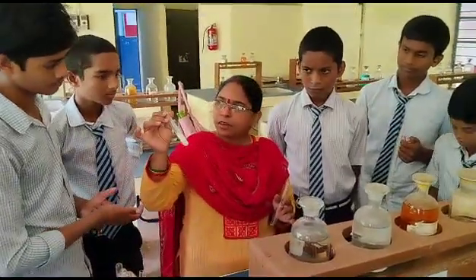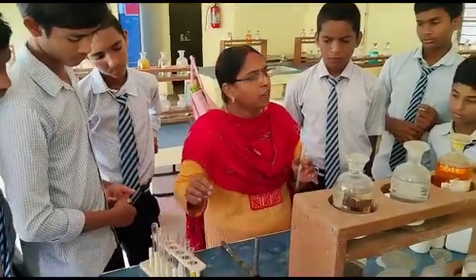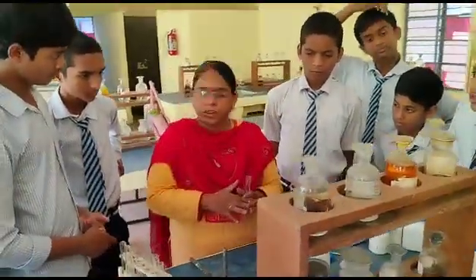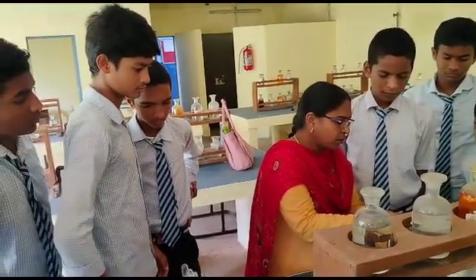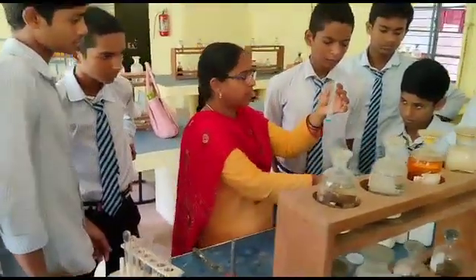White precipitate, barium chloride. With barium chloride, that's a confirmation test for sulfate. So that's why I am taking one more sulfate salt. One more sulfate salt I am taking. So this is also something we can take as a double displacement example.